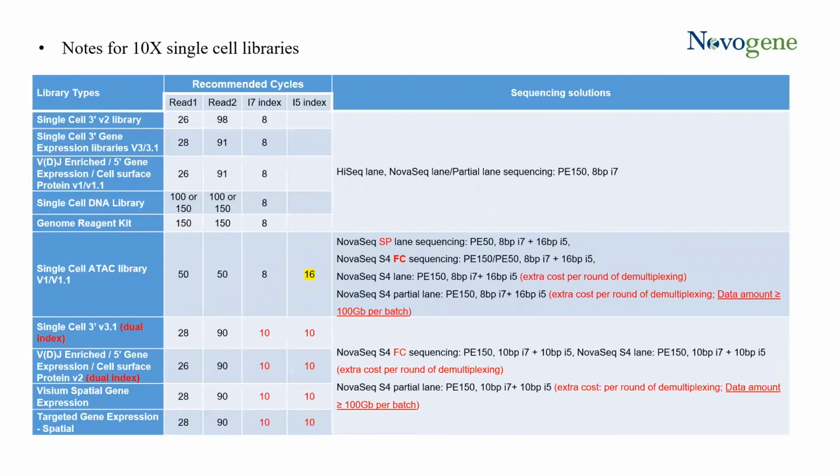Okay, really quick, this gets back to why it's important for us to understand your index approach and insert approach, because of some different library structures. So here is the 10x example. These are the read lengths and the index lengths. For these common ones here, we don't have an I5 index, and so this can be run on potentially any platform that we have.